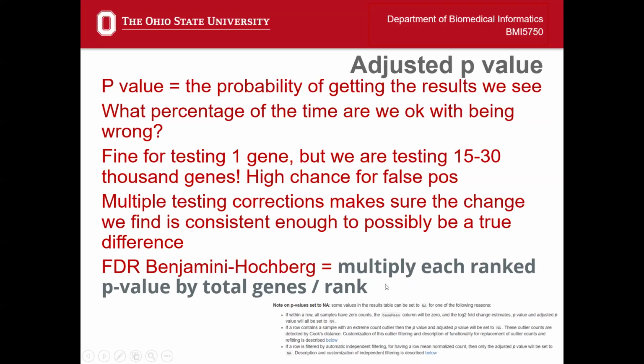Sometimes in DESeq2, you'll see p-values set to NA, and that's its own method of filtering the results.